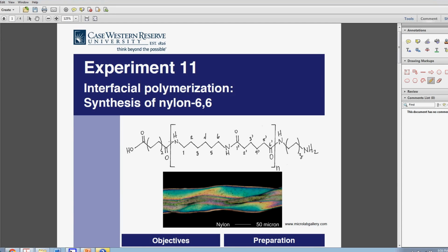in this reaction. I don't really want to go into a great level of depth in terms of talking about polymers or synthetic fibers in general. But if you look at the overall repeating unit of this polymer, and these repeating units are denoted by these brackets right here, you're going to see one part of the repeating unit is this hexamethylene diamine.